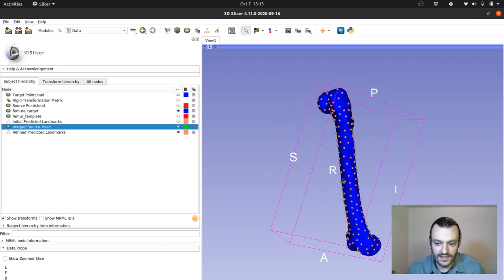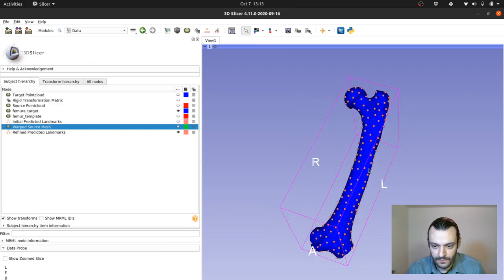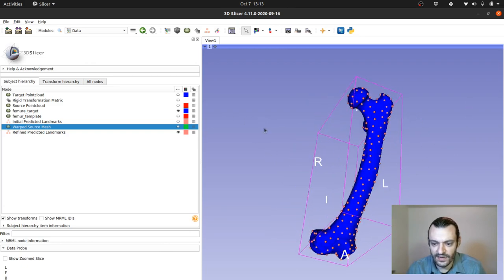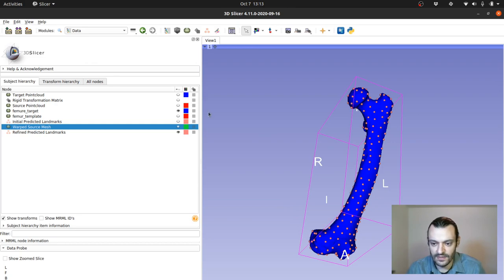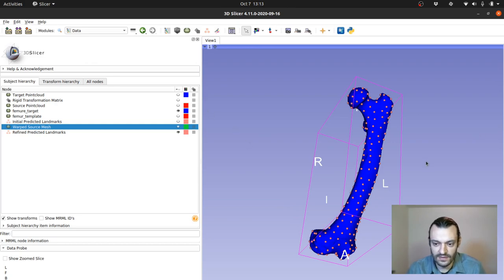And essentially that's how ALPACA works. It tries to provide a very straightforward useful tool to transfer landmarks from one specimen to another so that you don't have to manually landmark those specimens.